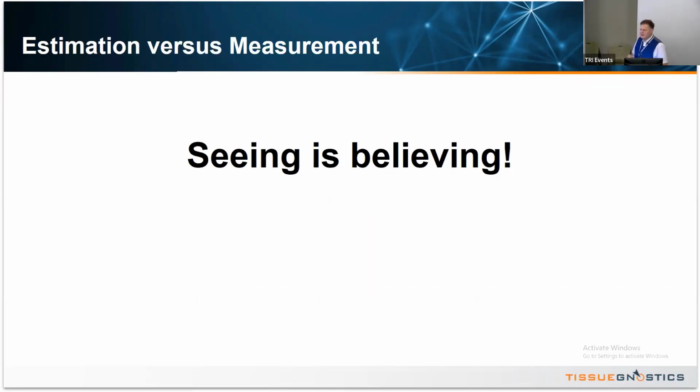Their data were based on whatever was available at the time: FACS, ELISA, Northern, Southern, Western. In the end, they came to me and said, Rupert, I need a nice picture. And I said, hold on, a microscope is more than a lens for a photo camera. It's a means to generate raw data. We just have to extract them from the image in a proper way, and that way is image analysis.